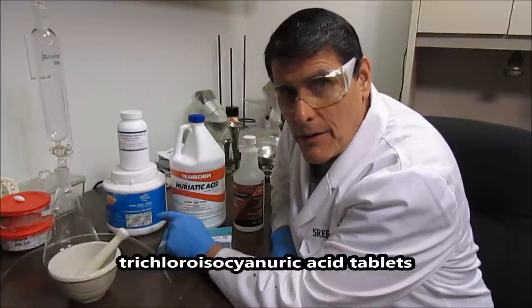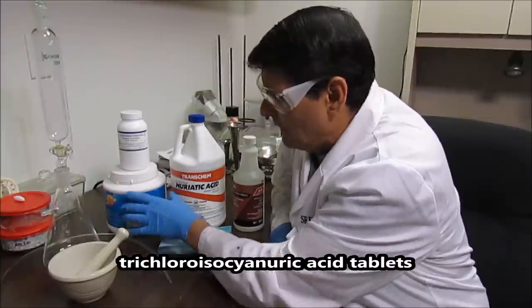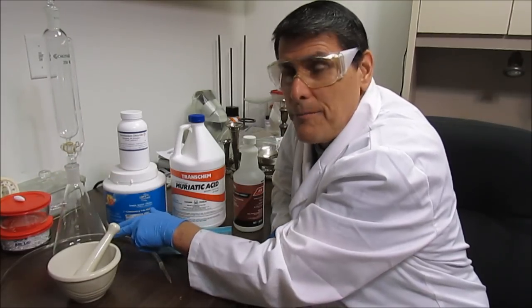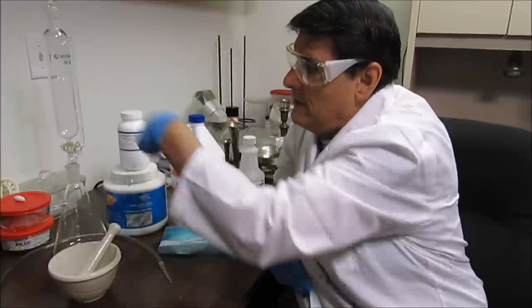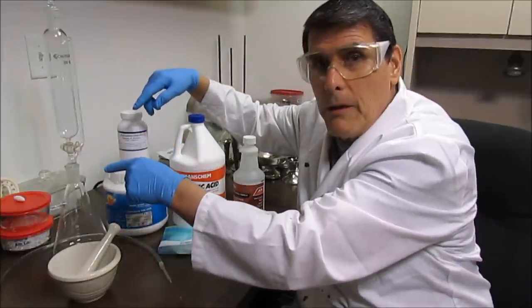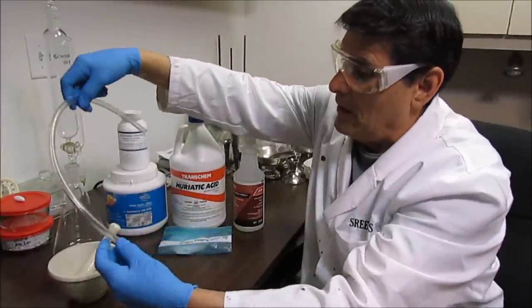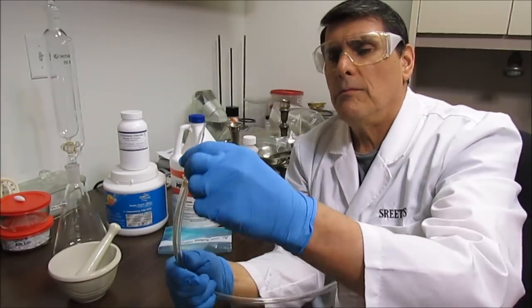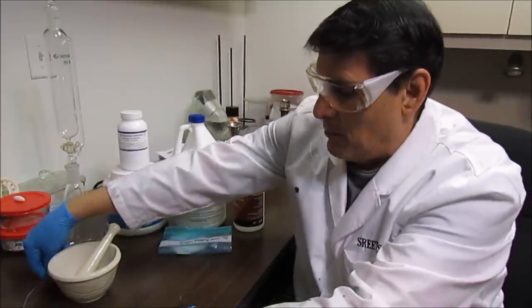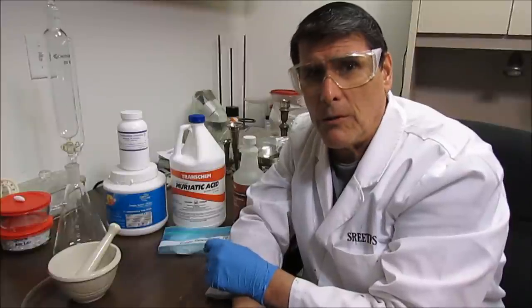It's called trichloroisocyanuric acid tablets. I bought these at Walmart or Lowe's — one of the places that sells swimming pool supplies. I'll take a tablet and grind it up with my little mortar and pestle and add it to this flask as my gas generator. I've got an addition funnel that's vented to prevent pressurizing. I'll put some hydrochloric acid in there and slowly drip it onto the ground-up chlorine tablets, then bubble the chlorine gas produced through the palladium solution to form a palladium salt that's soluble in ammonia.